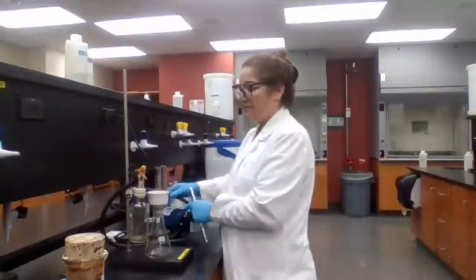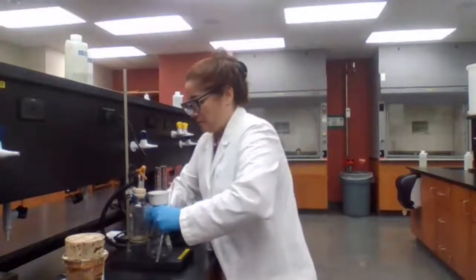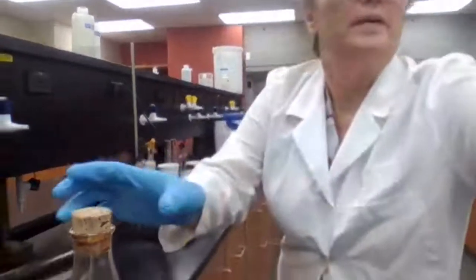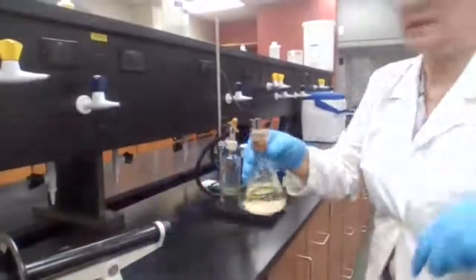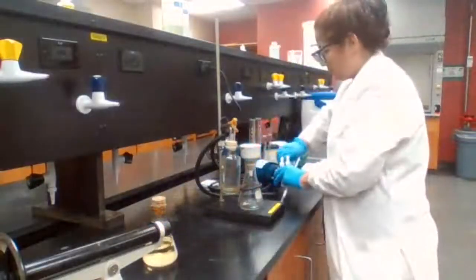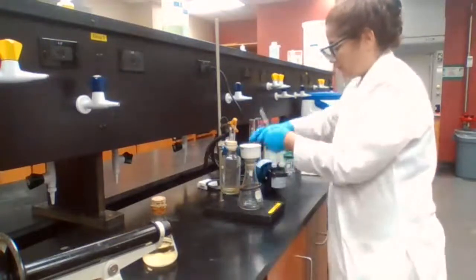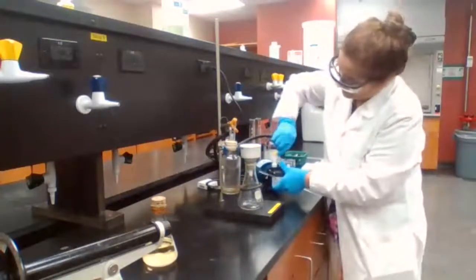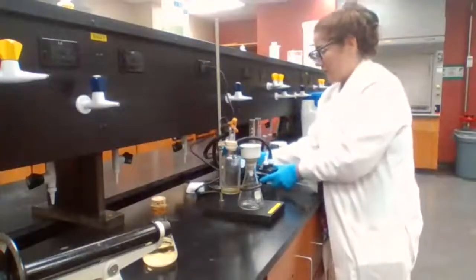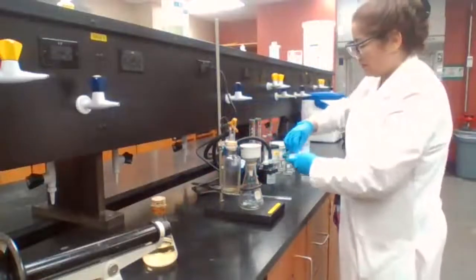To connect to vacuum. Change the angle so you could see. Use the filter paper.